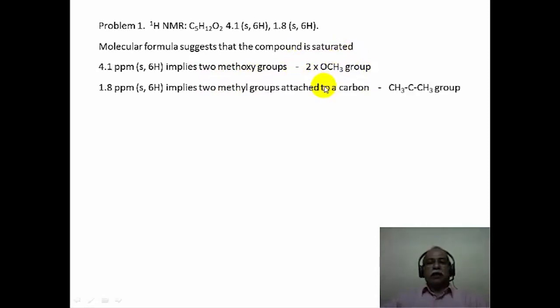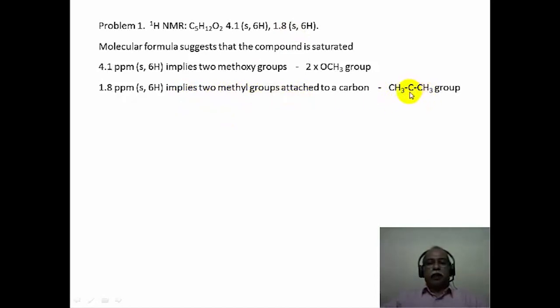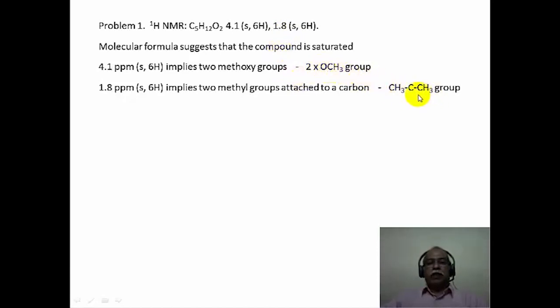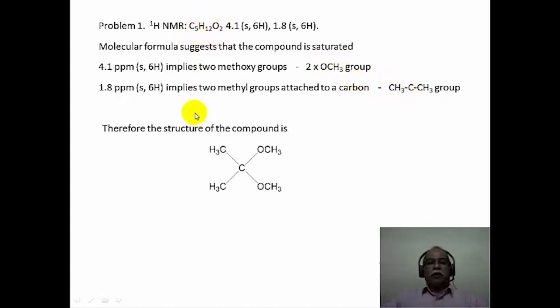Then comes the next chemical shift value of 1.8 ppm. This much smaller chemical shift value consists of 6 hydrogen as a singlet. This can only imply that there are 2 methyl groups attached to the same carbon — in other words, a gem dimethyl group. If you add up the numbers of carbons, hydrogens, and oxygens present in the fragments we have elucidated, it corresponds to the molecular formula. So the problem is essentially solved.